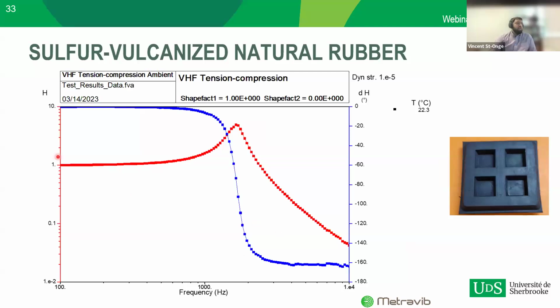When we ran the measurement, this is exactly what the software gave us. So here you see that we were supposed to be around 2,300. We're actually slightly under 2,000, so the model is not perfect. But it still helps us to define approximately where the resonant frequency was.